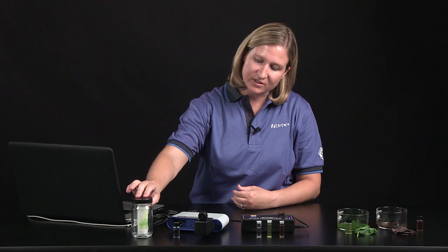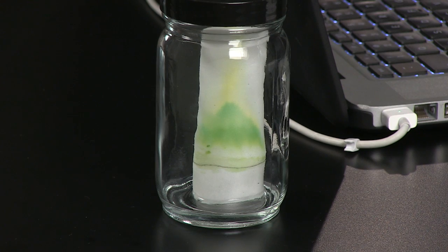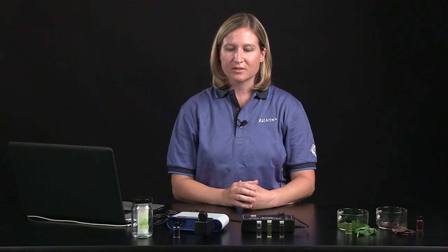A lot of biology teachers already do a great activity with their students, which is to separate the pigments from green spinach leaves into the different pigments using paper chromatography. This allows students to see that there is a green pigment in the spinach leaves, but there are also yellow and orange-colored pigments as well. The colorimeter and spectrometer allow students to gather additional data to make the activity more meaningful.